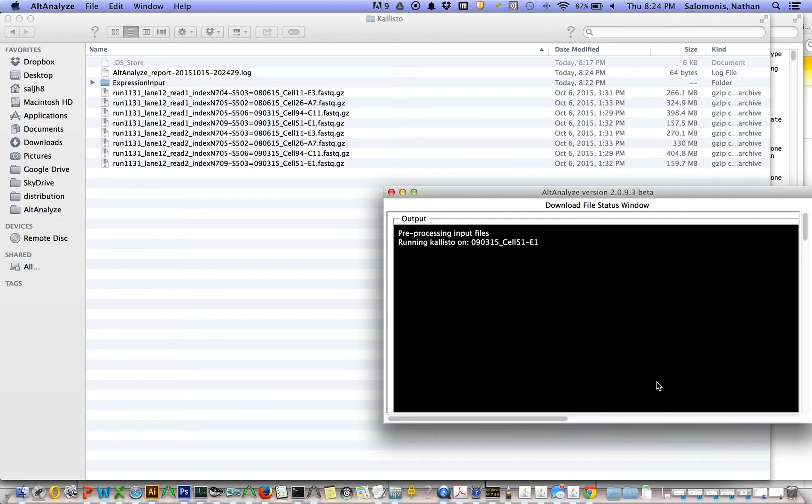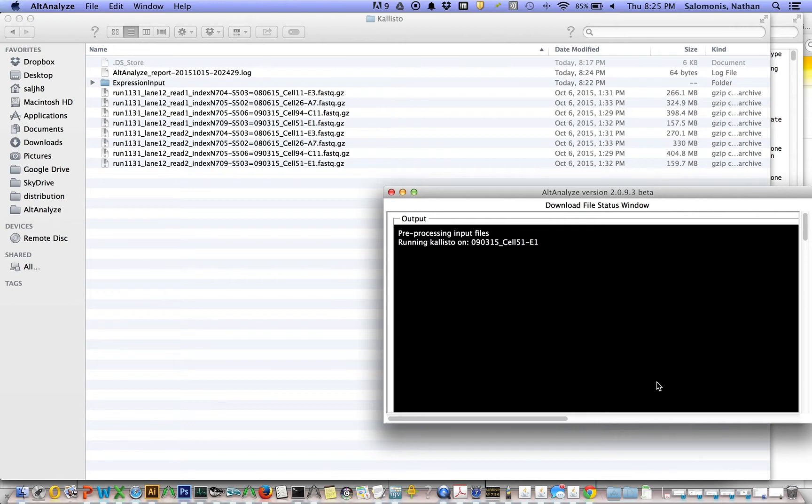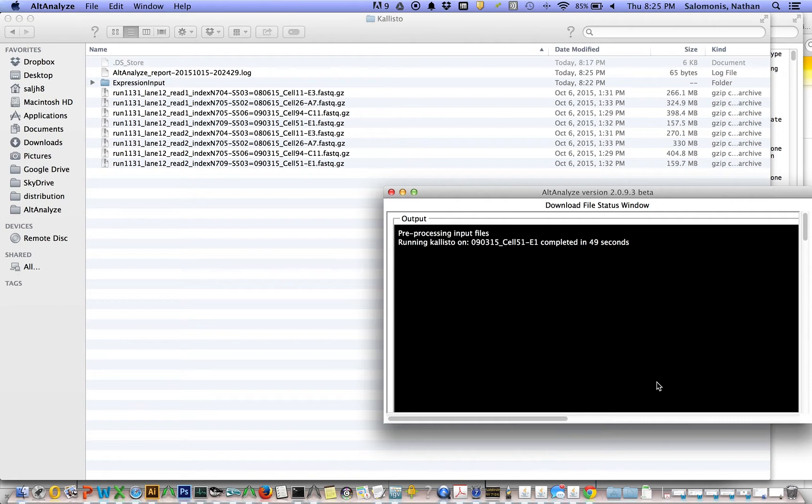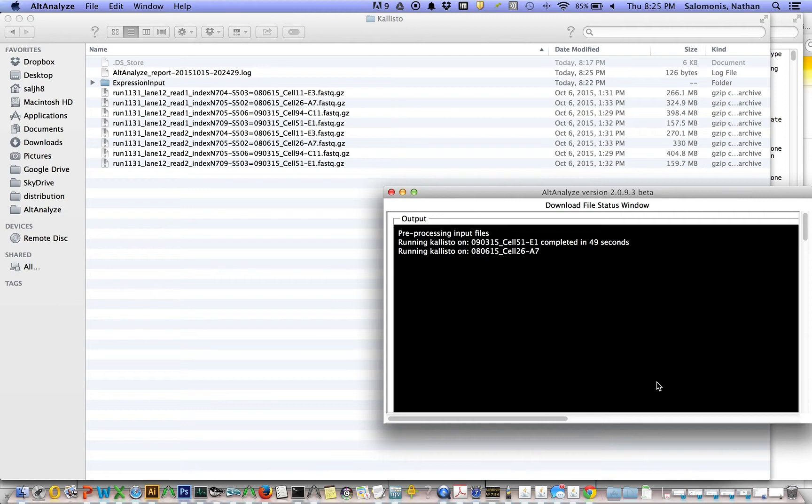Where did that transcriptome come from? Well, AltAnalyze will download that transcriptome file, in particular a FASTA sequence file for all RNA transcripts that correspond to the version of Ensembl which AltAnalyze is using. AltAnalyze is an Ensembl-centric piece of software. That means that there are different versions of Ensembl that are supported, Ensembl databases, in this case Ensembl version 72 for mouse. So the software is going to go online, it's going to download that FASTA file, and it's actually going to index that file using Kallisto to derive k-mers, all possible k-mers from the transcriptome, which it's going to use as its index for pseudo-alignment.